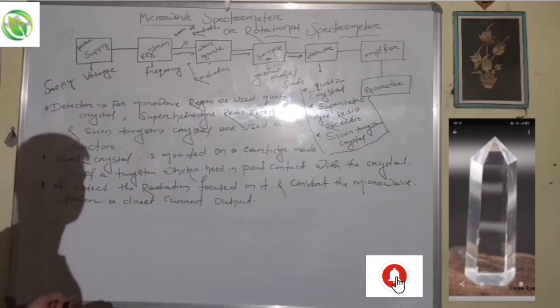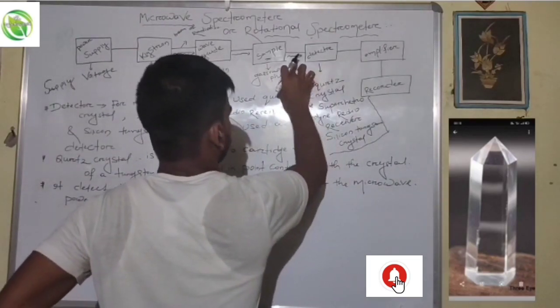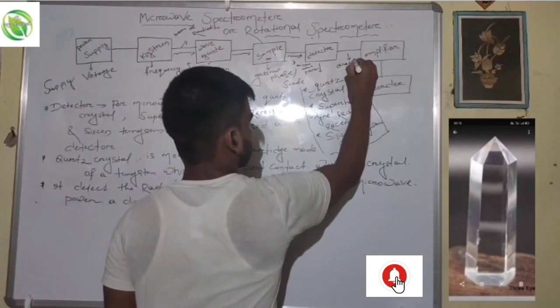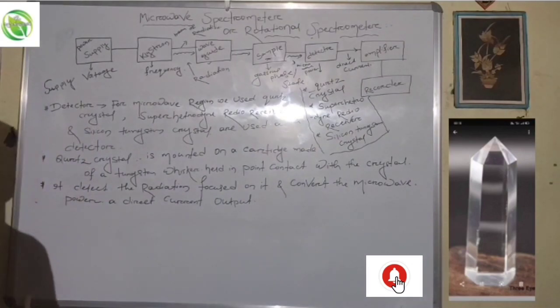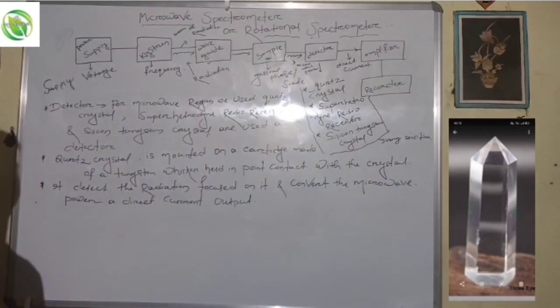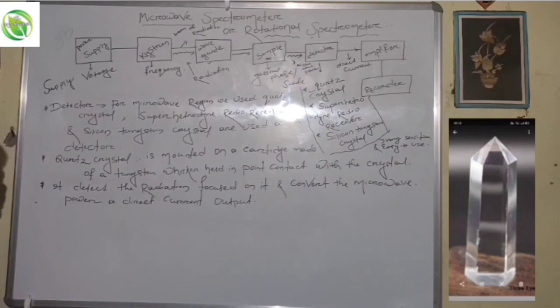This detector is quite sensitive. When the radiation is focused on it, it converts the microwave power to direct current. It is very sensitive and easy to use.